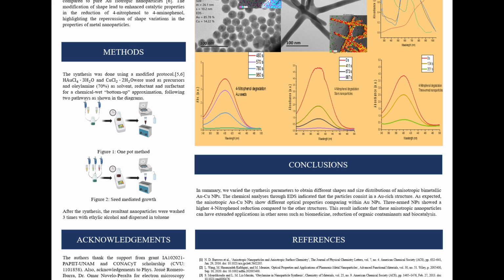We have watched how the modified synthesis parameters change the structures of the gold-copper anisotropic nanoparticles, and how this difference in shapes and size distribution has a consequence on the plasmon resonance response.